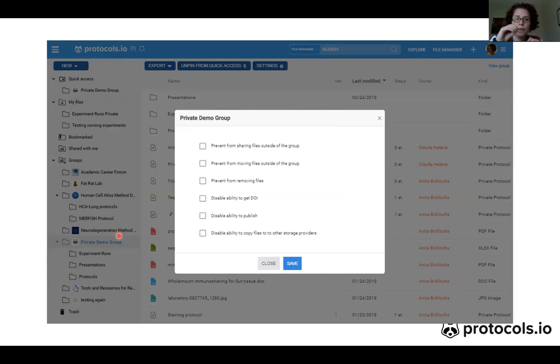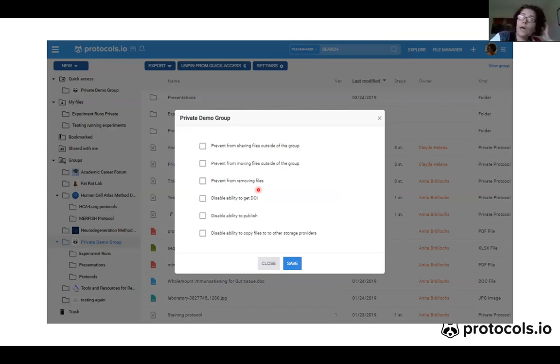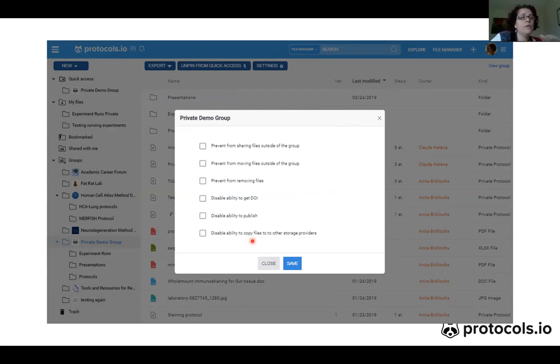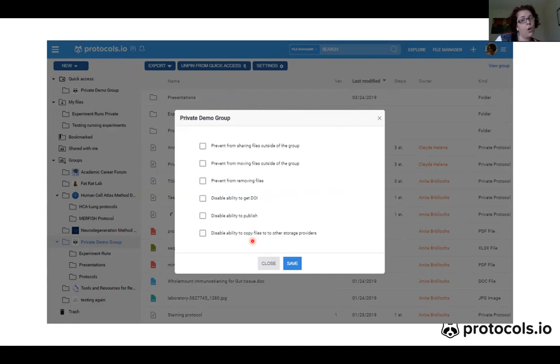In these settings, you can prevent anyone from sharing files outside the group, prevent people from moving files outside the group, prevent members from removing files from the group folder, and also disable the ability to get a DOI for the protocol, to publish the protocol, or to copy files to other storage providers like Dropbox or Google Docs. These settings apply for all group members except the admin and co-admin.